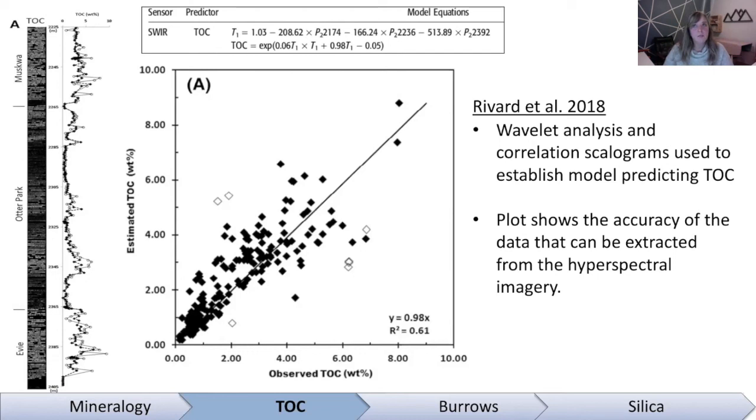For example, I know of a company that has a hand sampler mounted to an automated core logger, and it takes images with each spot, but you wouldn't end up with the same data where you have pixels that actually contain the spectral data. So it wouldn't be as continuous. What was the next question?